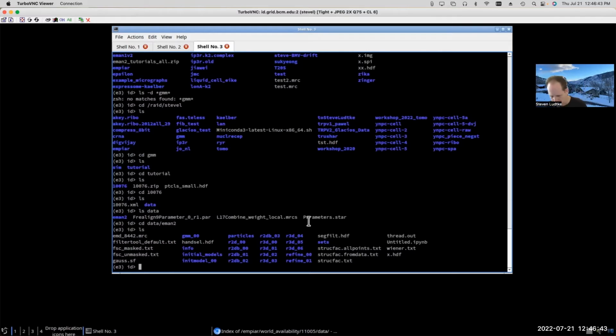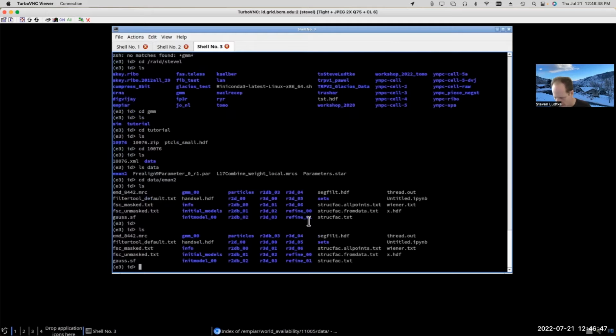Okay, all right. This is from the official tutorial for the GMM, and that made use of EMPIAR 10076, which was a complete ribosome data set, I think. Actually, maybe it's just a large subunit or something like that. I think it's maybe some sort of depleted ribosome, but anyway, regardless. Okay, so what we have here is one of the new style EMAN2 refinements.